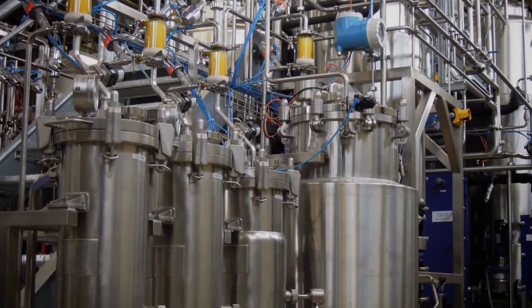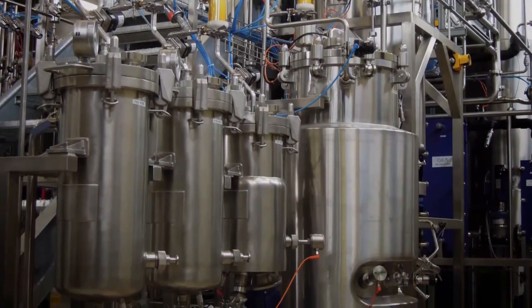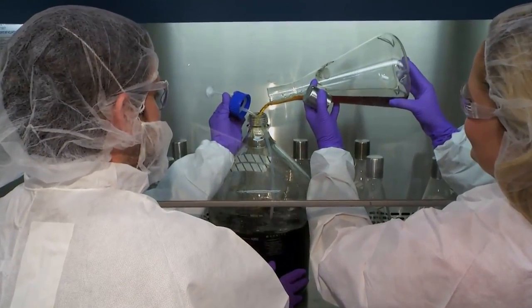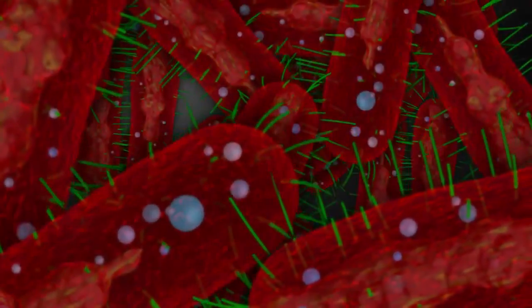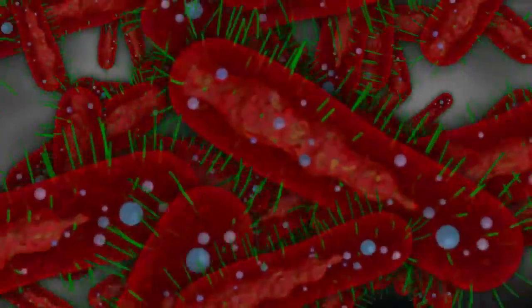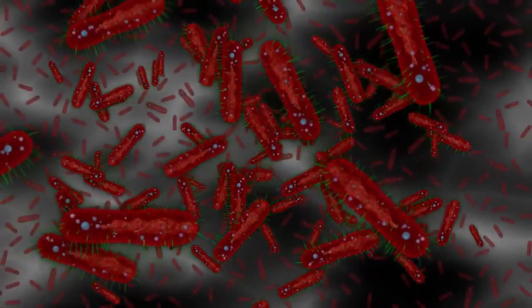Many of today's biotechnology companies rely on fermentation to produce their products. In the typical process, a particular microorganism is used to produce a valuable compound or product. Fermentation permits us to scale up that production. Instead of a single cell producing our molecule of interest, we use hundreds, thousands, and then millions and millions of these tiny microfactories to produce many different products on a commercial scale.